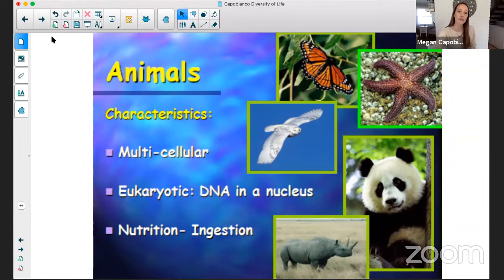All right, and first I'm probably going to focus on plant cells. Now, the way we are going to do that is I do have a microscope here that is hooked up to my computer, so I'll be able to share what I'm able to see. And I also have a prepared slide for you. So this one, if you can see it there, has been already prepared.